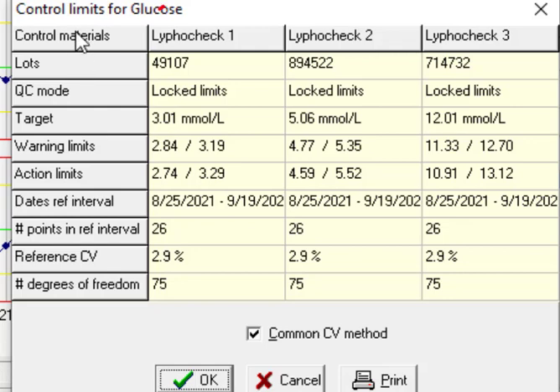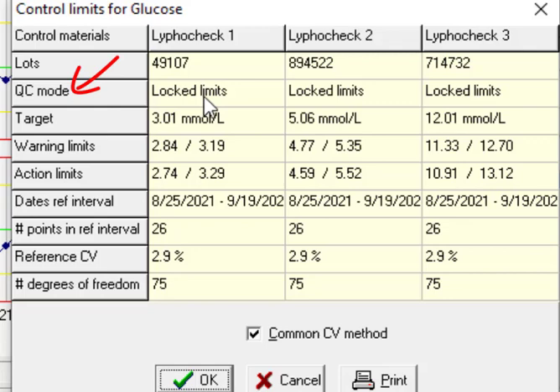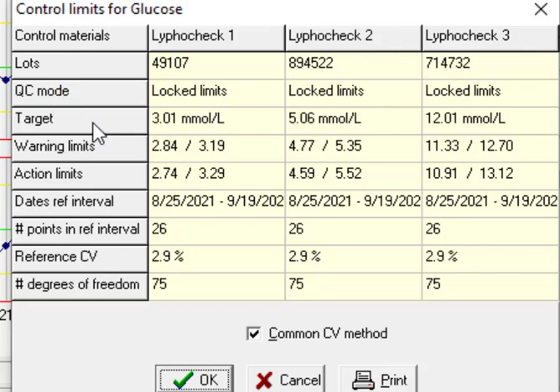Name of control materials that we define on parameters. Lot number, QC mode as I told before is for lock limits. Target that is the mean for a specific number of data.